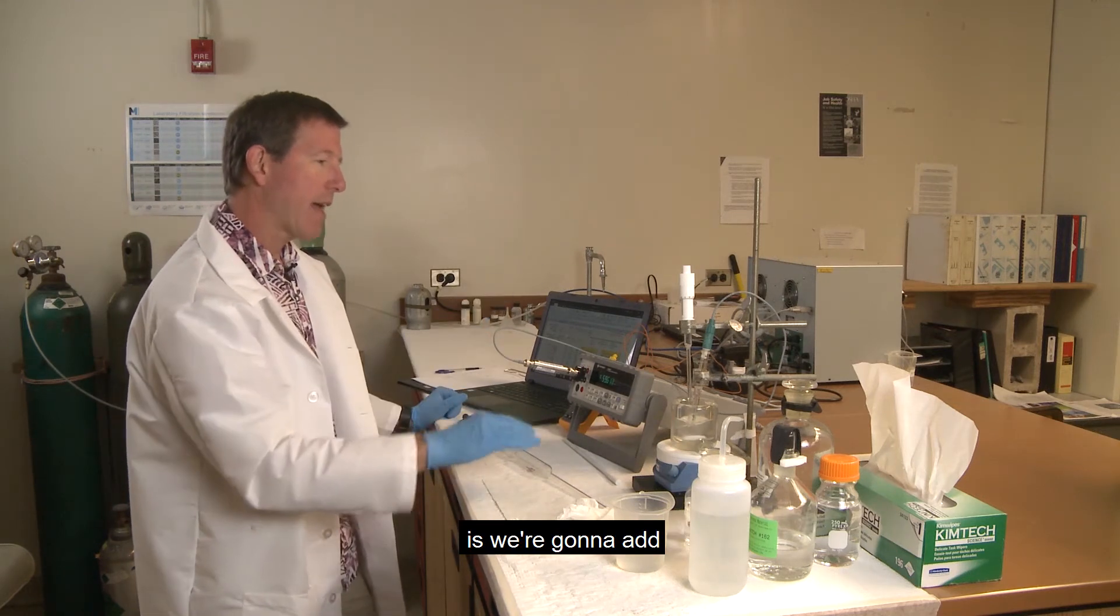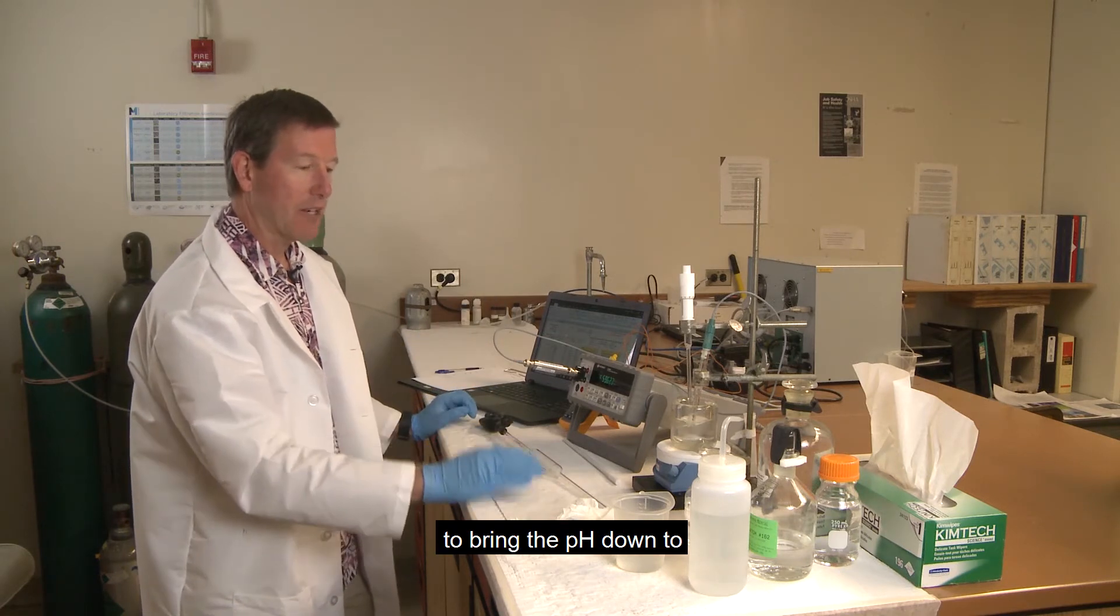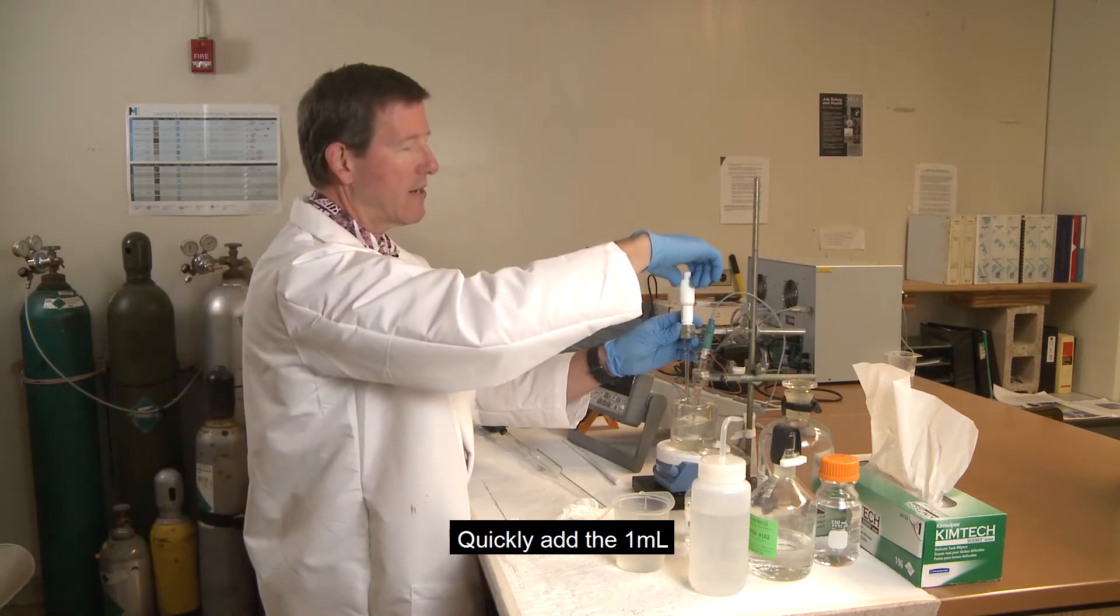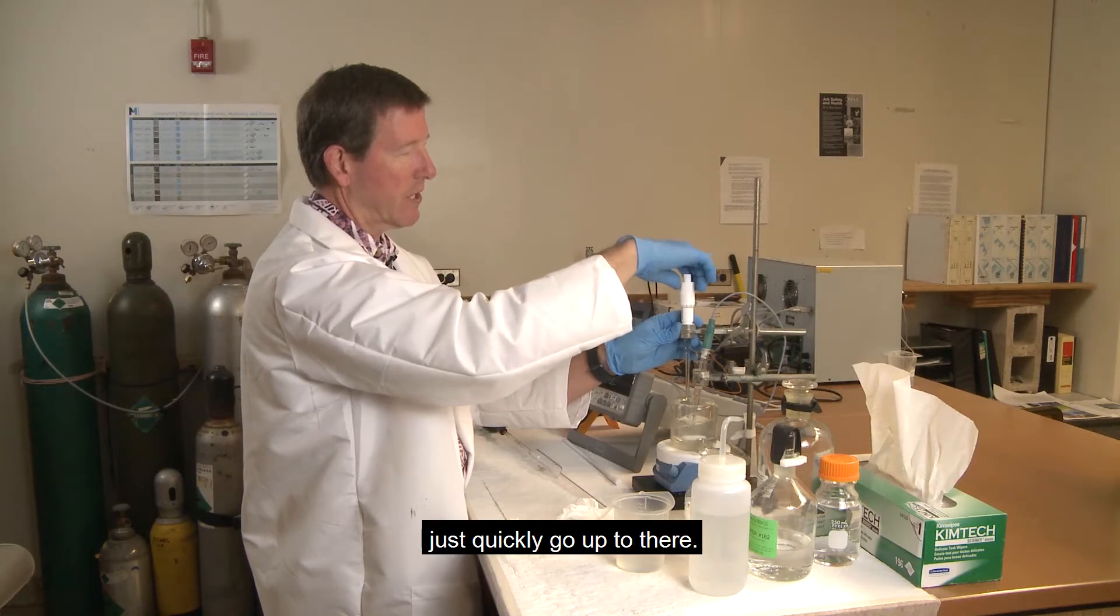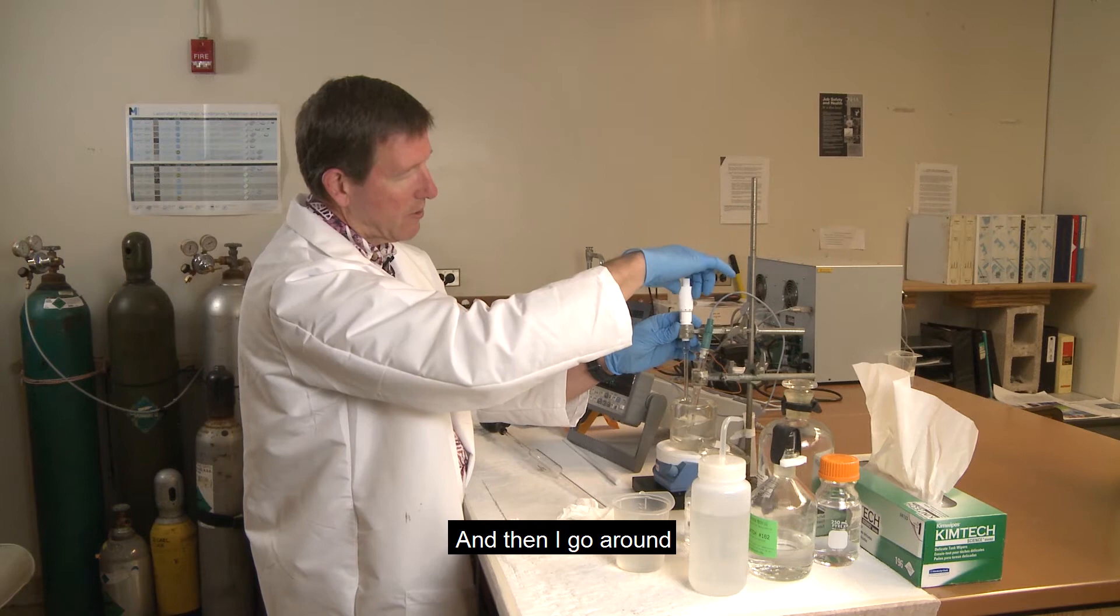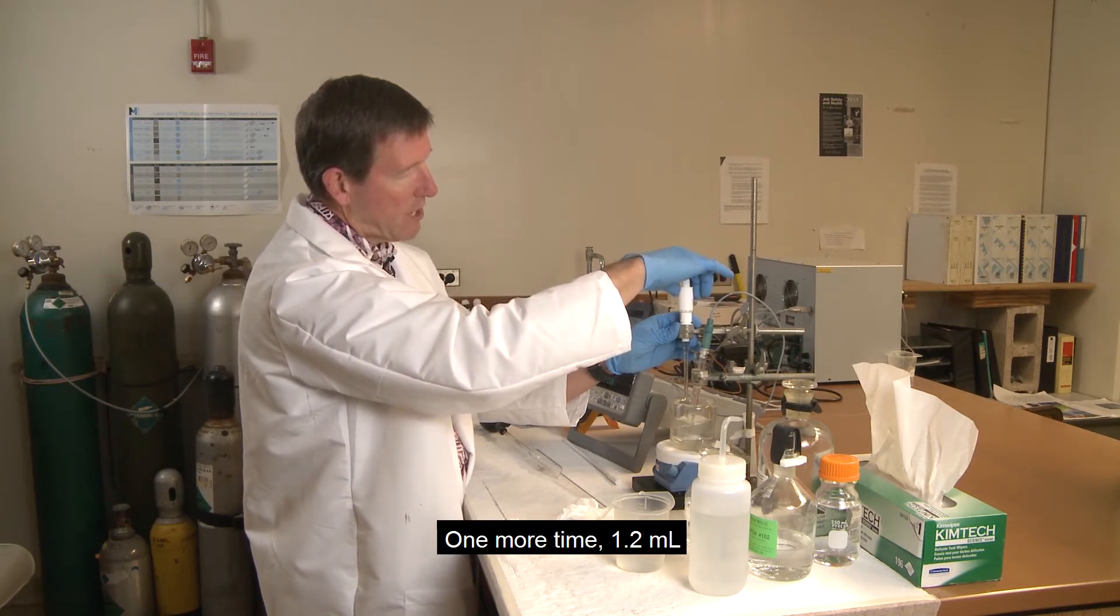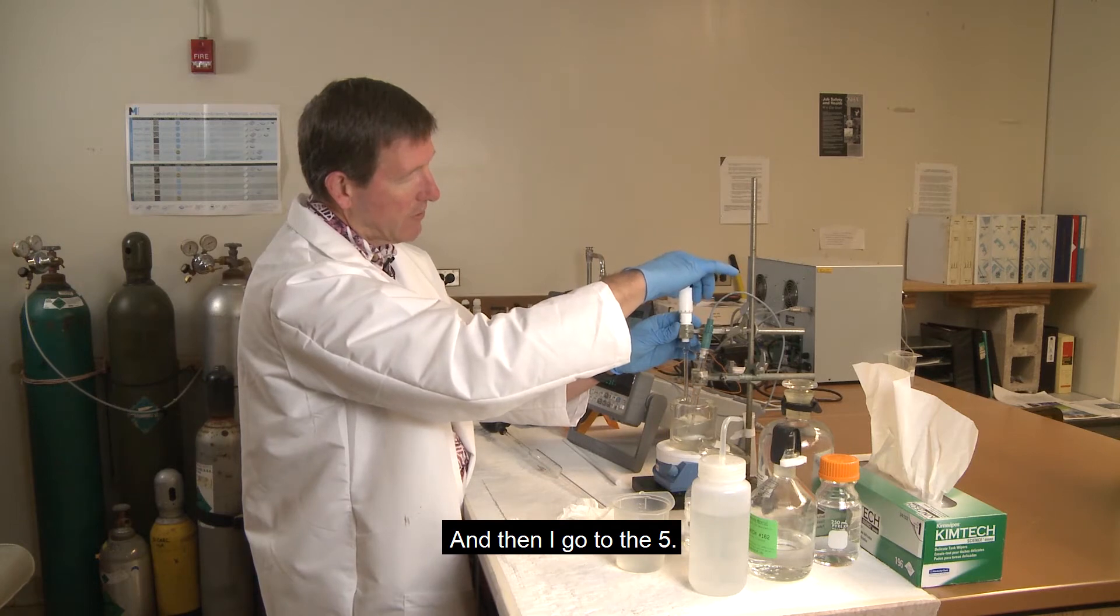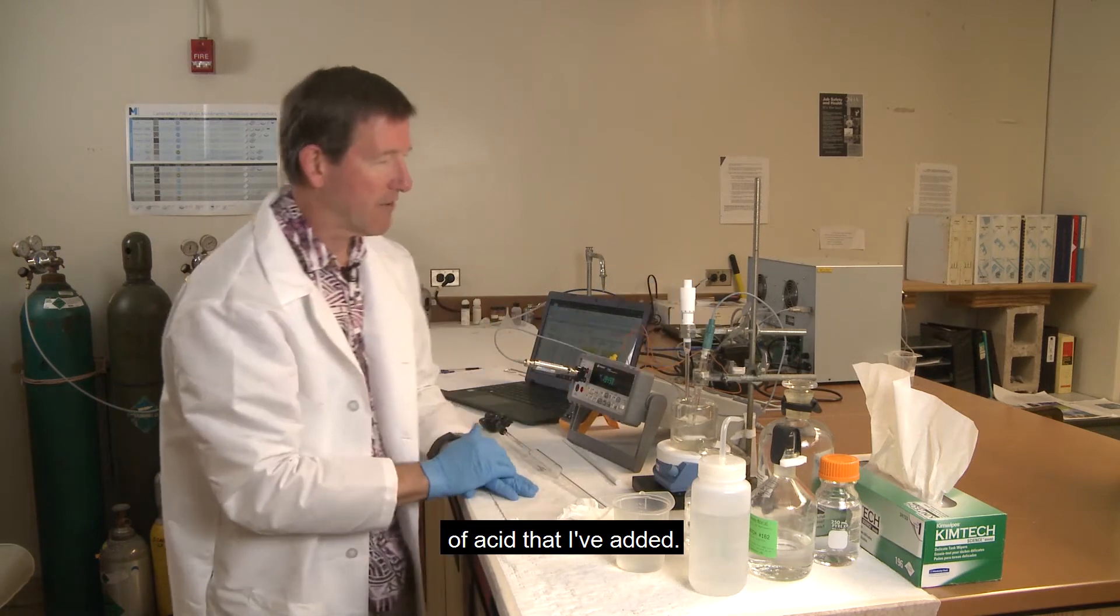Now what we're going to do is we're going to add a shot of acid to bring the pH down to the point where we want to start the titration. Quickly add the one milliliter, because there's an obvious mark there, so you can just quickly go up to there. And then I go around once more, that's 1.1. One more time, 1.2. And then I go to the five. So that's 1.25 milliliters of acid that I've added.